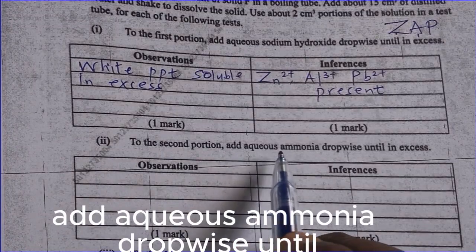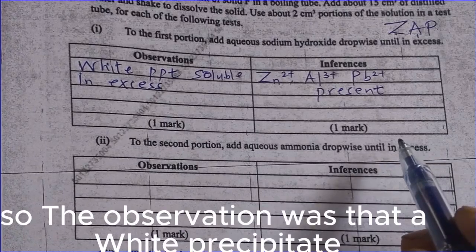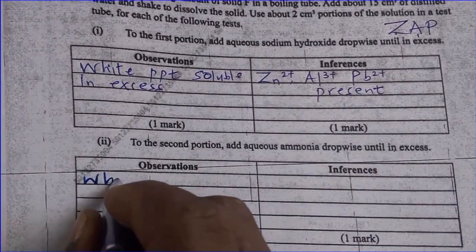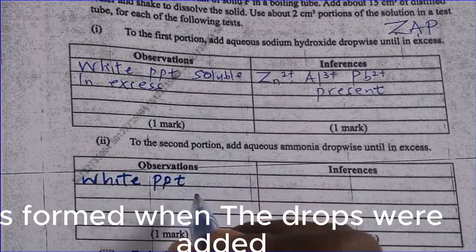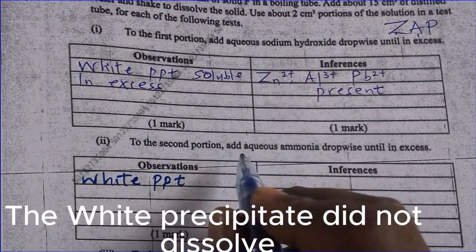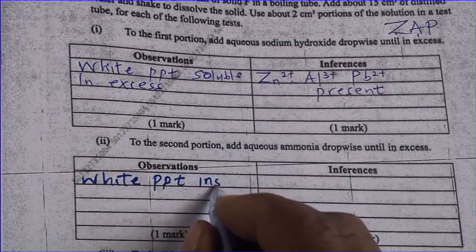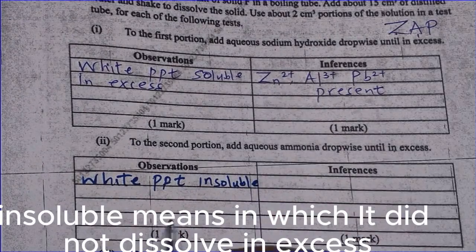To the second portion, add aqueous ammonia dropwise until in excess. The observation was that a white precipitate was formed. A white PPT is formed when the drops were added, but in excess, the white precipitate did not dissolve. So a white PPT, insoluble. Insoluble means it did not dissolve in excess.